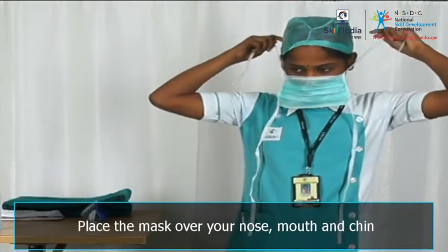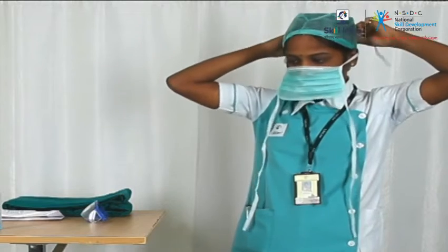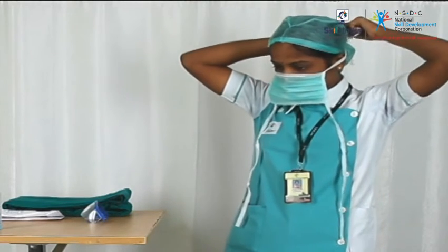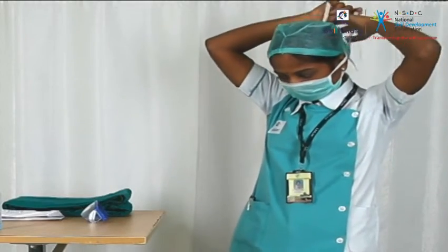Place the mask over your nose, mouth, and chin. Fit the flexible nose piece over the nose bridge. Secure on head with ties or elastic, and finally adjust to fit.